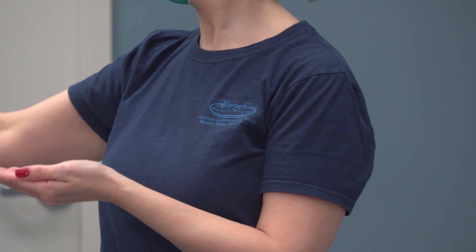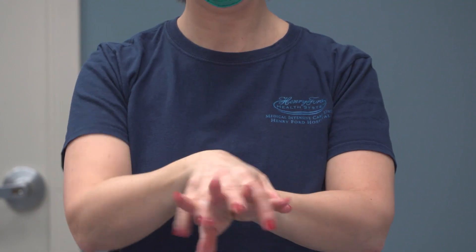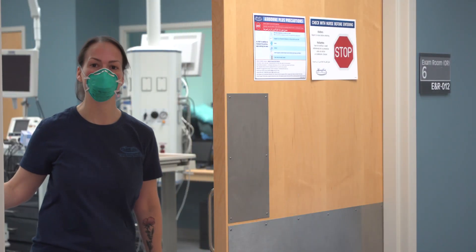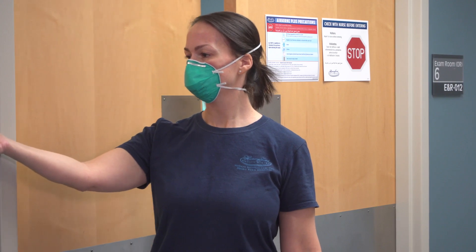Perform hand hygiene. Ensure drying time prior to leaving room. Perform hand hygiene using alcohol-based hand sanitizer or soap and water. Ensure to dry prior to next step.